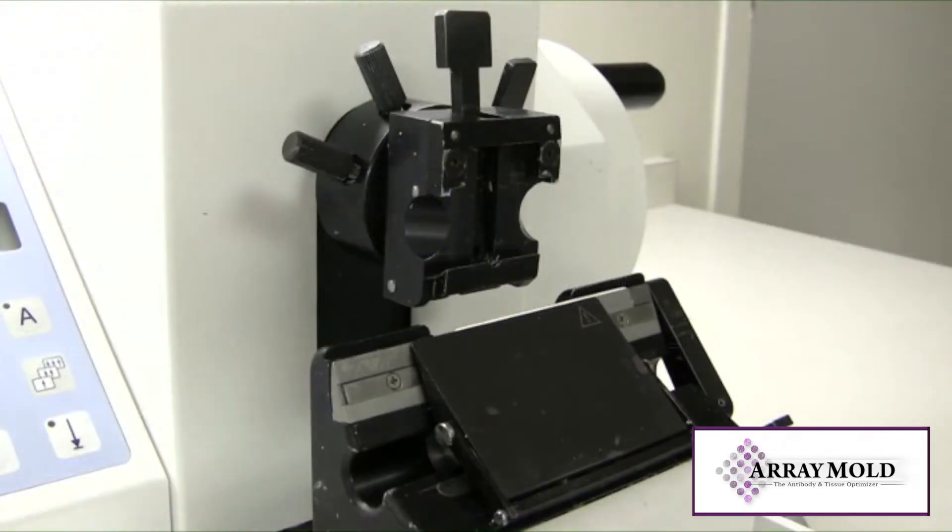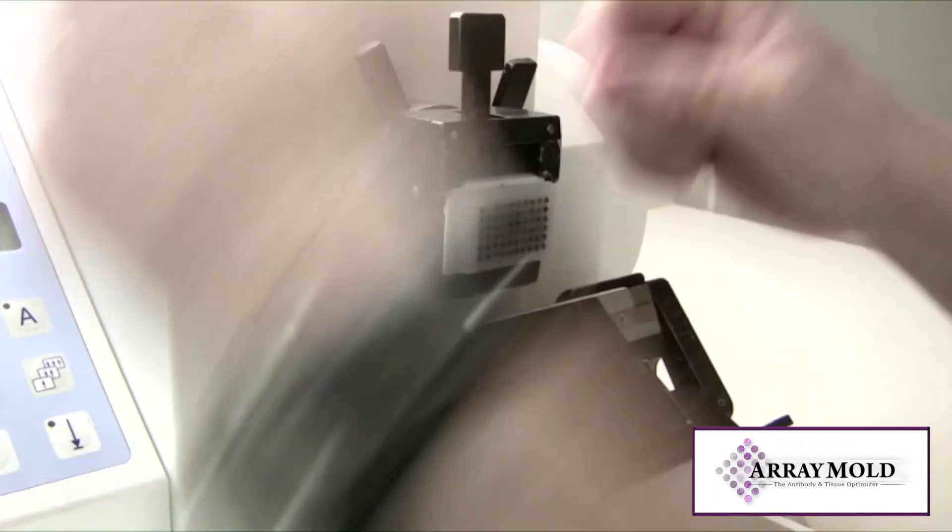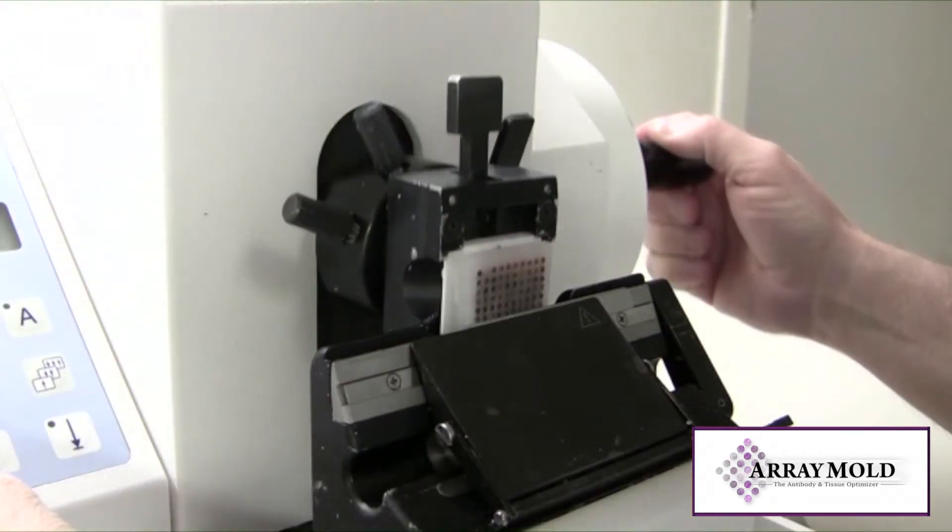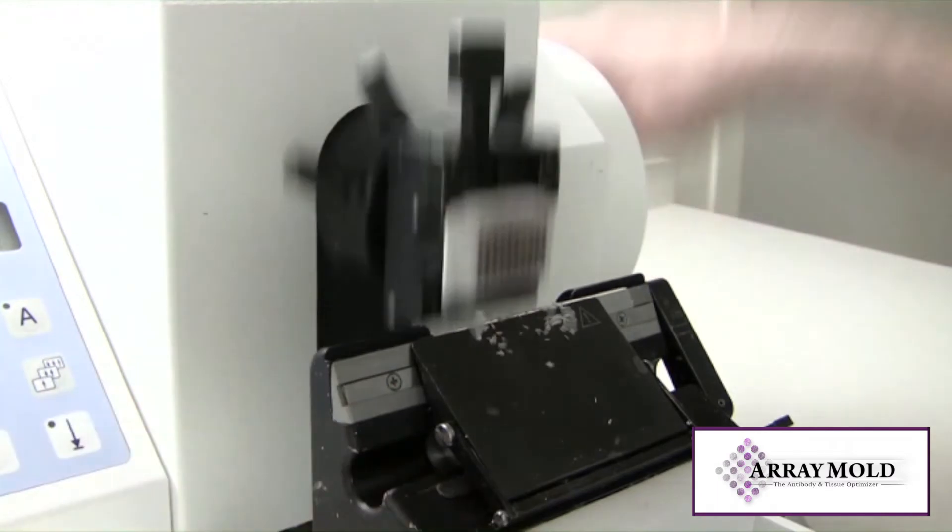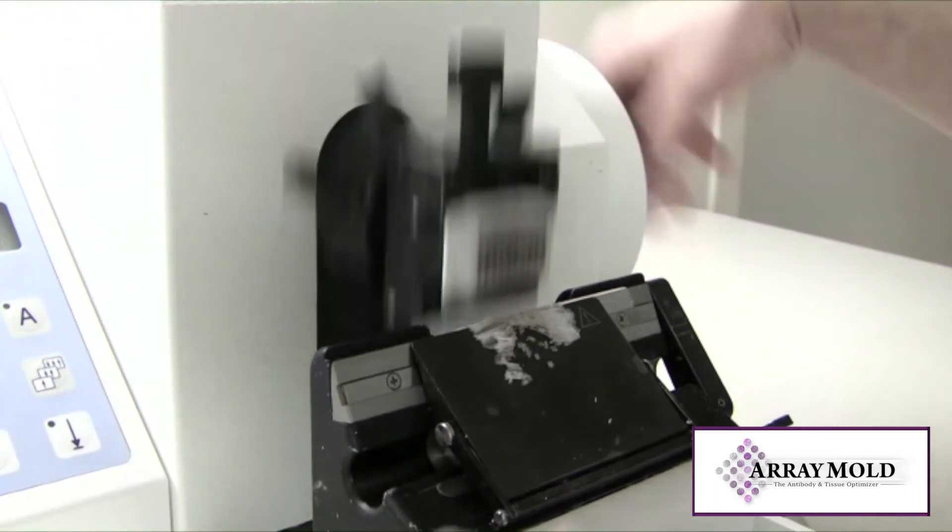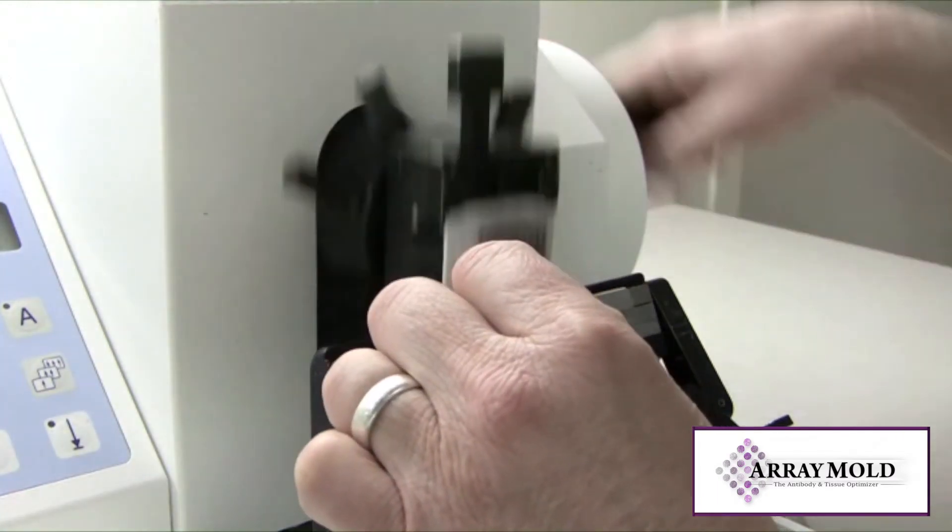First trim into your array block so the surface is flat. If your microtome chuck is at a different angle than your array block, you may want to adjust the chuck so it's flat against the block. You don't want to cut away valuable tissues facing into your array block.